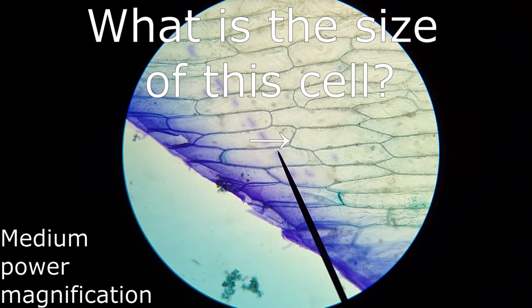As a practice question, I would like you to calculate the estimated size of this onion cell. Pause the video to estimate the size and see if you were correct when you continue the video.